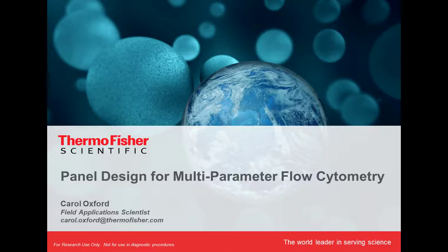Thank you so much, Xavier. I really appreciate the opportunity to come talk to you about flow cytometry. I've done this for quite some time. I was also the UC Davis Flow Cytometry Core Director there for about 25 years. So I think flow cytometry is one of the most elegant technologies in science. When I did flow cytometry, multi-parameter meant two fluorescent parameters. And now the people at the cutting edge of flow cytometry are doing 32 fluorescent parameters. So it's changed quite a bit during that time.